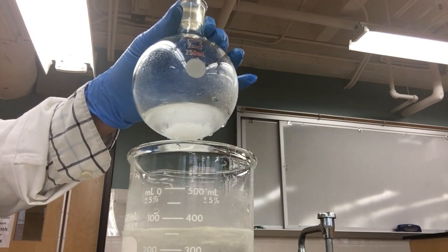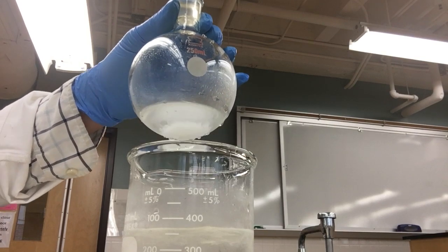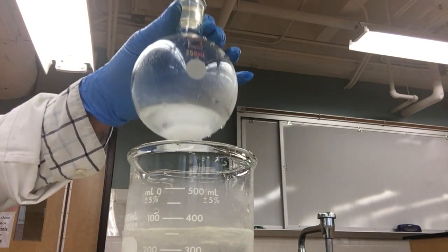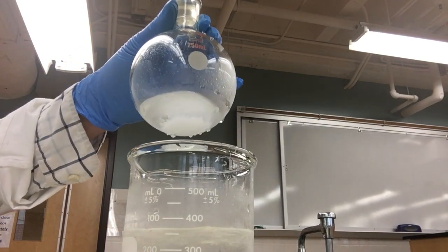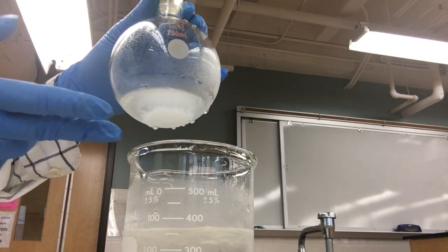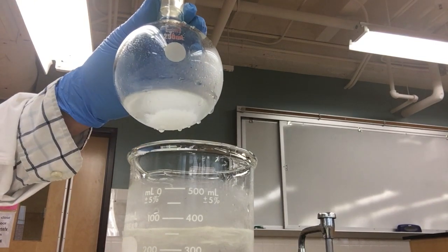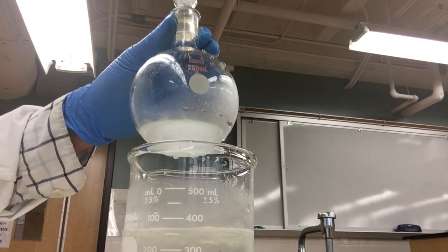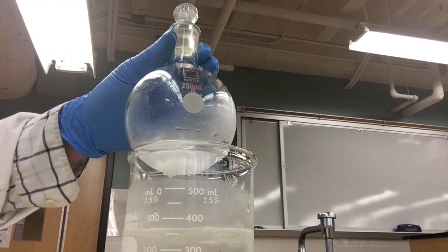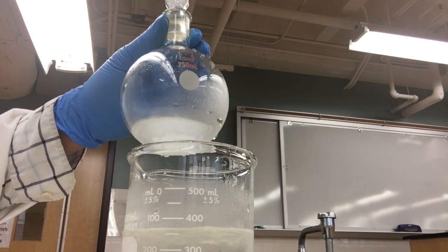So here is our reaction flask, the 250 ml round bottom flask, in which I have added 8 ml of water, 0.1 mole of butanol and 0.12 moles of sodium bromide. There is a reason why we are adding the exact amounts. And to this we are going to add 13 milliliters of concentrated sulfuric acid.